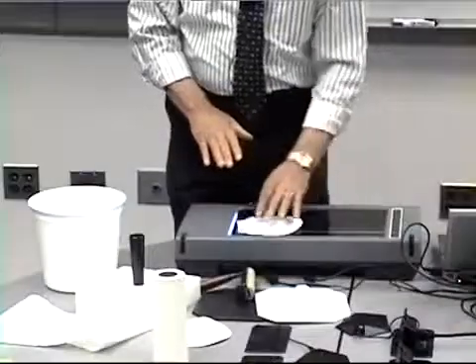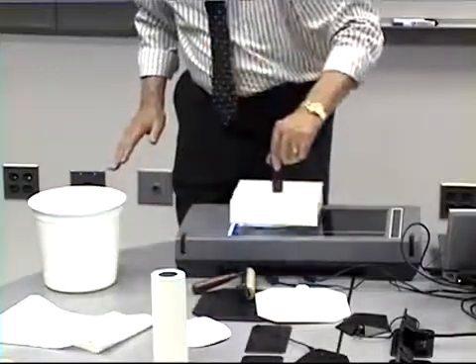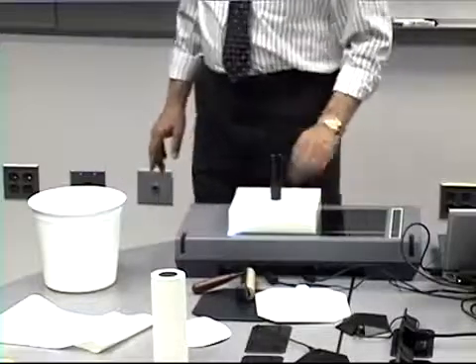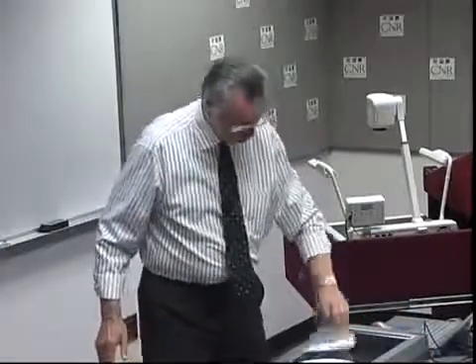When you take it off the hand sheet mold, the blotter paper is on the top, and what we're suggesting is that you simply bring the blotter paper with the hand sheet wet over to the scanner, position it on the scanner, put the black backing on the top of the blotter paper and the hand sheet, and then do the scan. Very simple, very quick. And you can measure then all of the dirt in the hand sheet.